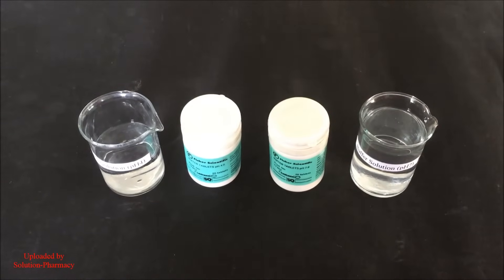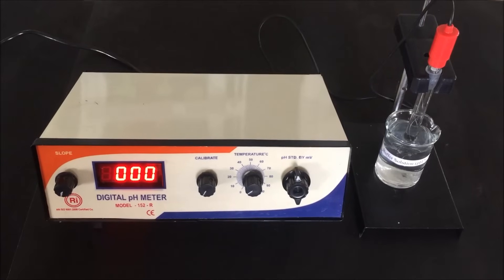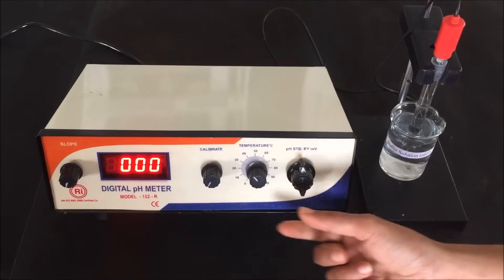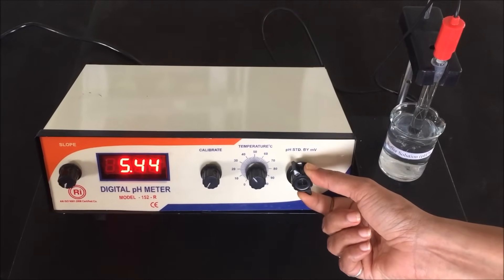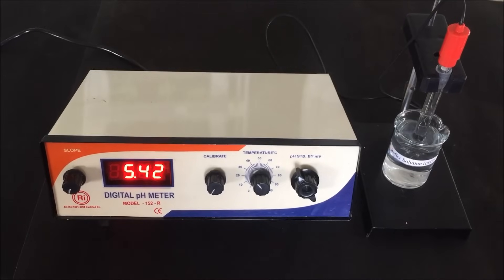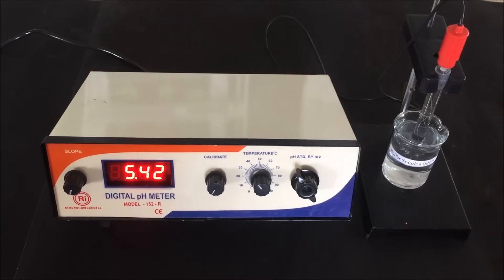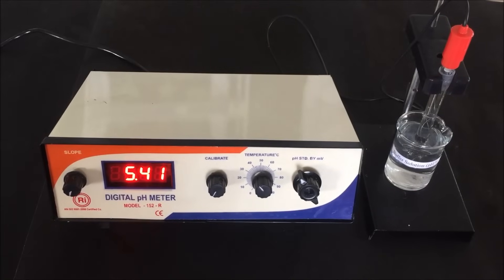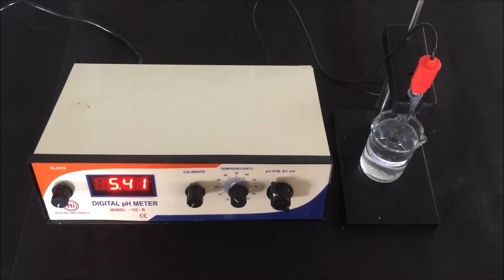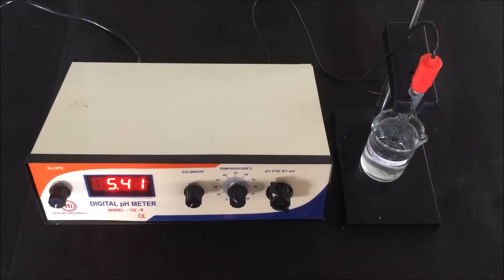Now we are going to perform the calibration process of the pH meter. First, set the temperature setting knob to 25 degrees Celsius, or the temperature of the buffer solution, by rotating the knob. Then dip the electrode into the pH 7 buffer solution and set the knob to pH mode. Wait until the display shows a constant reading — this will take time, so keep patience until the reading becomes constant. The display reading becomes constant at pH 5.41.